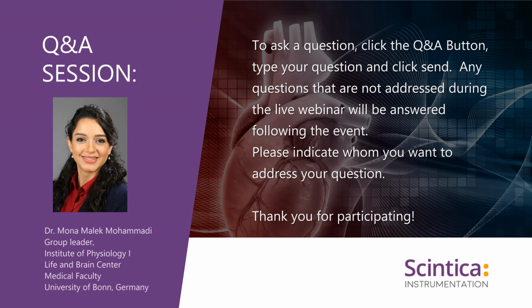It sounds like it's a combination of, like you mentioned, a lot of things. The strain of the mice, yes. Older, more veteran mother, yes. And then careful practice, making sure the sutures and everything. So it's a combination of everything. So I imagine one would expect, if you don't follow everything, you can expect some mortality.